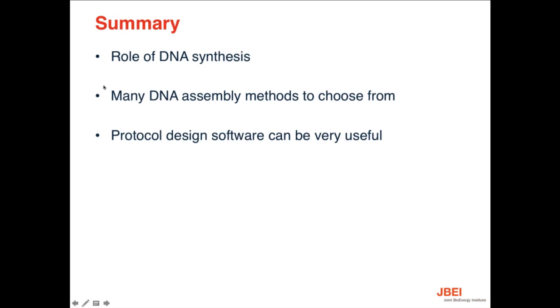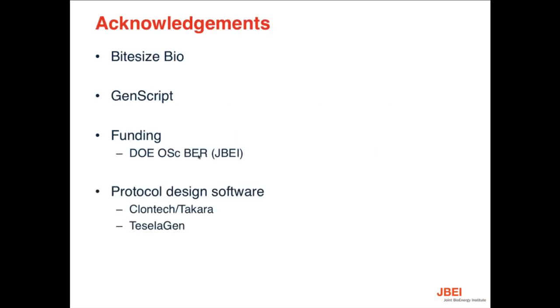There's lots and lots of DNA assembly methods to choose from, and new ones are getting created all the time. There's lots of methods that I didn't get a chance to talk about, like the BASIC method, or Amyris's LCA type of an approach. And I also really highlight that having software that can help design these protocols for you can be extremely beneficial, not only to reduce time and labor, but to save money, and also to avoid any mistakes that might cost you months.